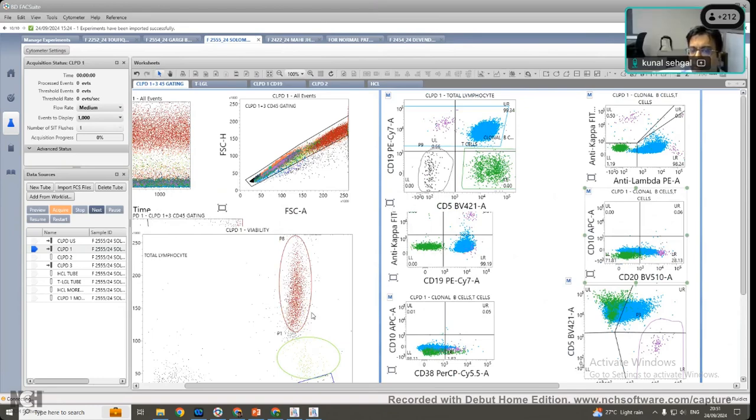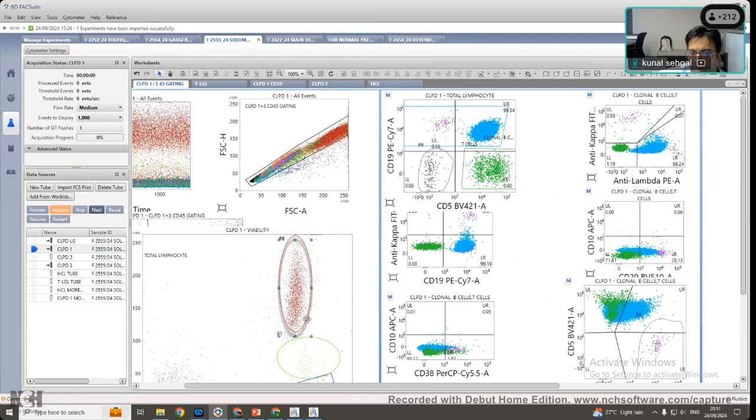Most common lymphoma in peripheral blood. Yeah, louder. Somebody said it louder. Mantle, yes, 5 is positive. Any other lymphoma which is CD5 positive? So CLL, SLL. Excellent. CLL, SLL.